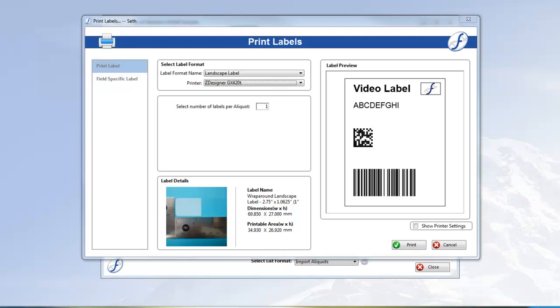Label formats can be designed to have barcodes, human-readable data, or a combination of the two, and you can personalize them much like a sample's entry form or report with pictures and free text.